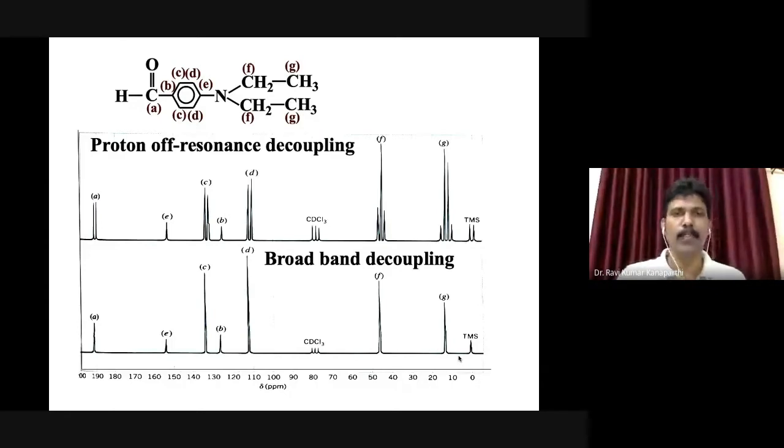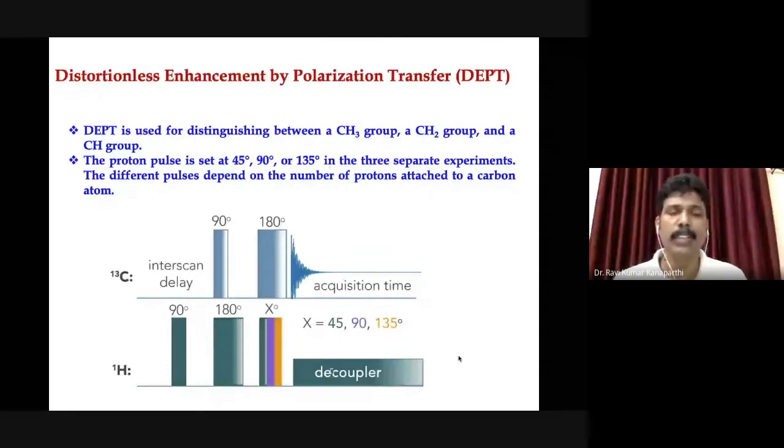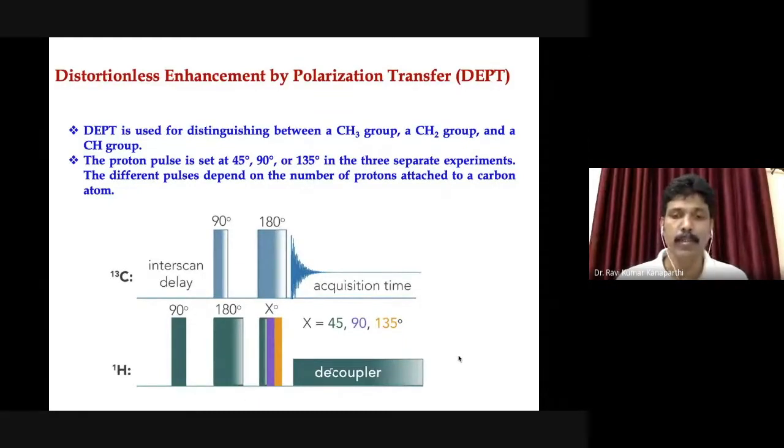Okay, fine. So now the third one I have taken up. Usually those are the two techniques that we use, but this is a special technique which was given a little bit of importance in a recent CSIR question paper. Therefore, I have taken up this technique also to explain briefly. Again, I am not really interested in explaining the physical concepts behind this distortionless enhancement by polarization transfer. In shorthand notation, it is the DEPT technique.